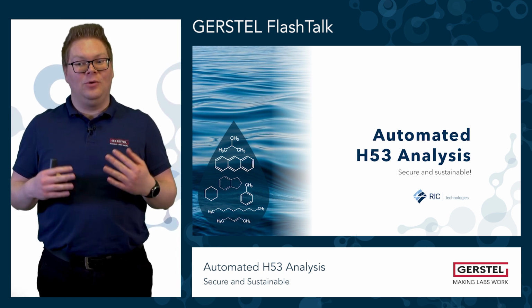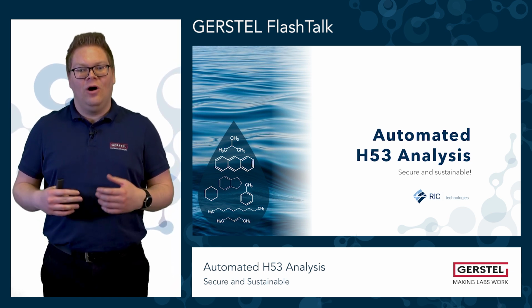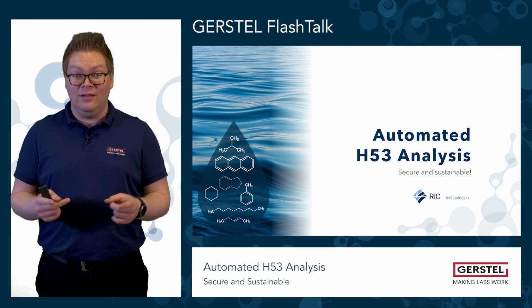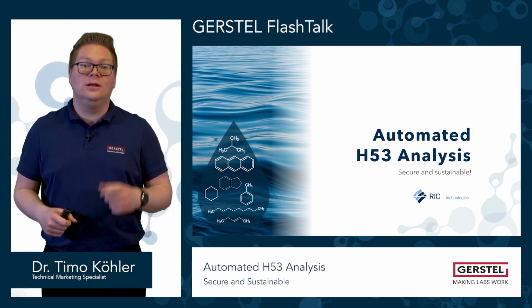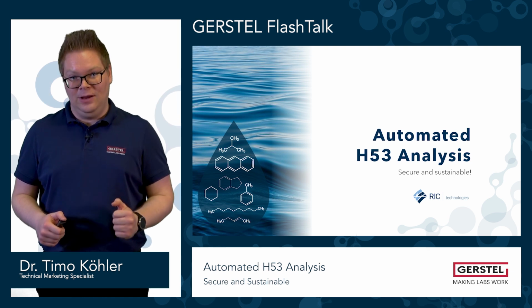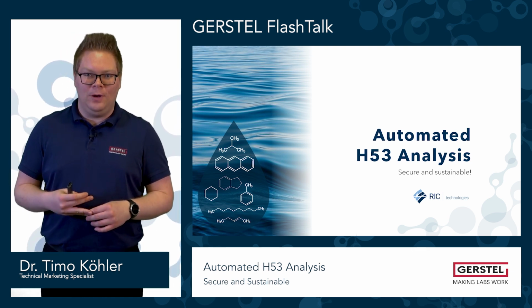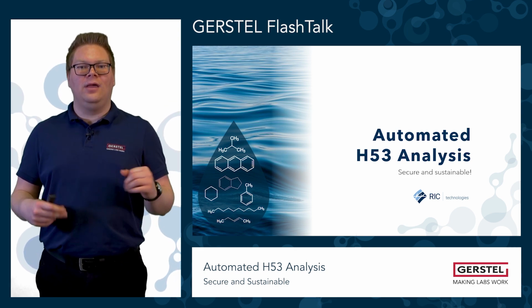H53 analysis brings light into the darkness of hydrocarbons in the environment. Find out in this FlashTalk how this can be done safely and sustainably. The automation of this method using the GERSTEL MultiPurpose Sampler was developed by the RIC group.